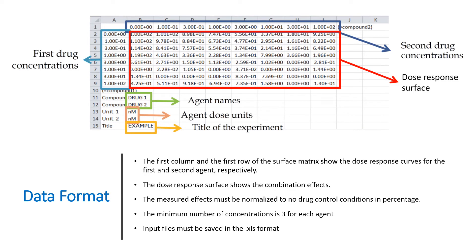To start the analysis, you need to format the input data file according to the data format as shown here. The first column and the first row of the surface matrix show the dose-response curves for the first and second agent, respectively. The dose-response surface shows the combination effects. The measured effects must be normalized to known drug control conditions and values must be tabulated in percentage. Hence, the first cell of the surface matrix is 100 and the other cells of the matrix show positive values between 0 and 100. In case of cell growth assay, measured effects are the surviving fractions. You can add or remove both rows and columns from the matrix to obtain the format that is appropriate for your experimental design.